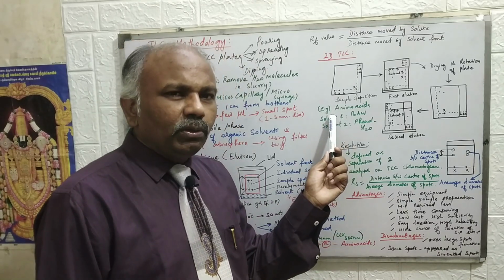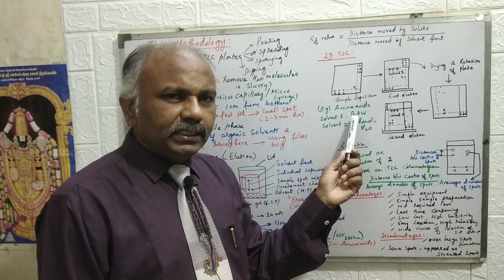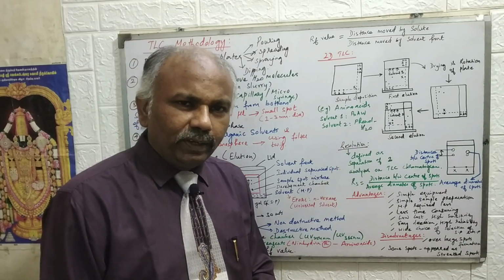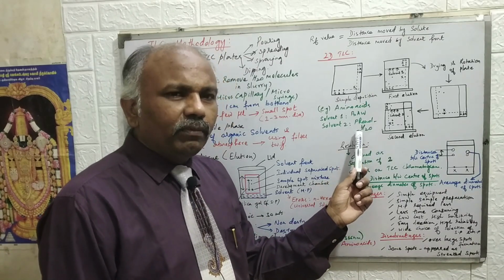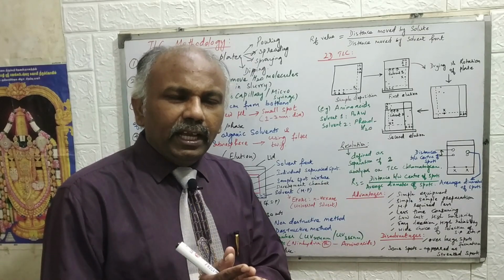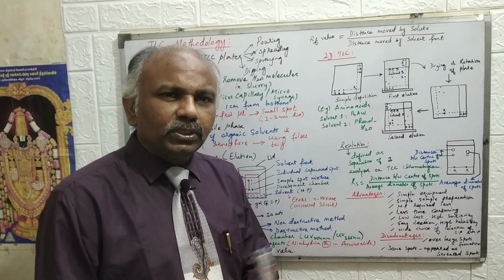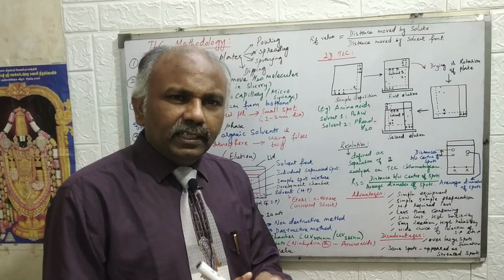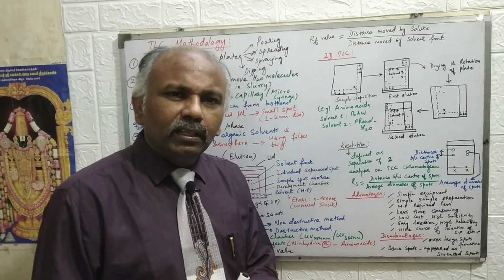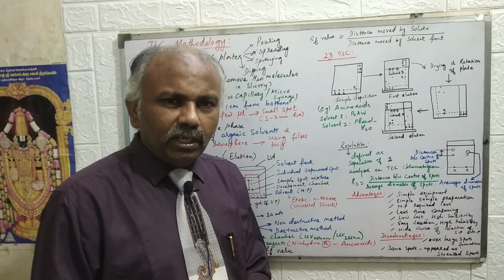For example, if you want to separate amino acids by two-dimensional TLC, the first solvent system we use is butanol, acetic acid and water in the ratio of 4:1:5. The second solvent system is a phenol water system. With 20 amino acids, all 20 will be very clearly separated if we use the two-dimensional TLC plate. It acts as a contour map to identify where the amino acids are located on the TLC plate. So this is an observation of two-dimensional chromatography.